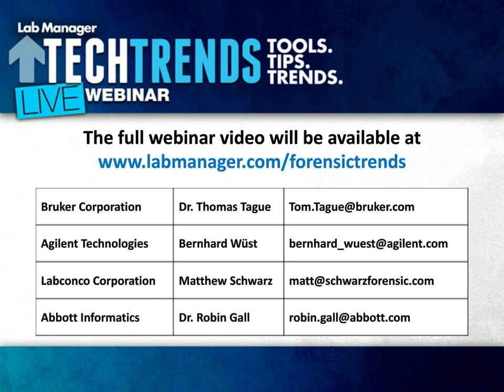Thank you. And what do you think is the best post-treatment technique for getting the best results? Right now, with the testing that I've done with these CA, dye-infused CA solutions, if you have the ability and the consistency with your chamber to make them work, I find that they're absolutely the best because you eliminate the chemical handling, the additional applying of chemicals, water rinse, the hazardous waste involved with that, and the time and effort. Other than that, I've seen some great results with some of the new UV-IR capture systems of full spectral imaging and some white light photography.